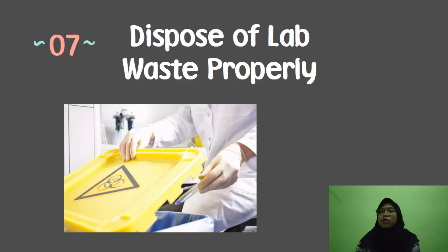You had better know what to do with your experiment when it's over. Before you start an experiment, you should know what to do at the end. Don't leave your mess for the next person to clean up.